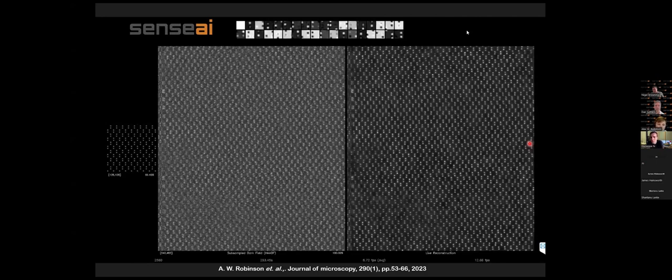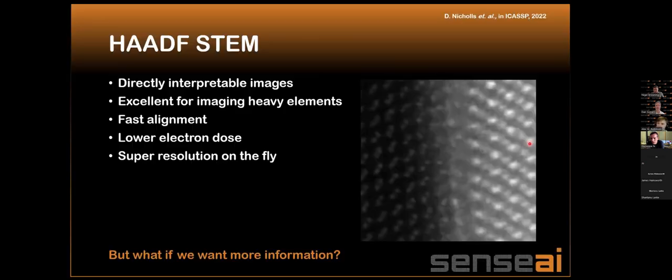So am I slightly mistilted, as in the previous example? Am I slightly away from focus, away from astigmatism? The denoising approach will exaggerate those features so that you can make faster adjustments during your alignments and your acquisition, and of course during your analysis. So obviously, Alex, this also entails less damage if you can spend less time on the specimen. This is very important. Absolutely.